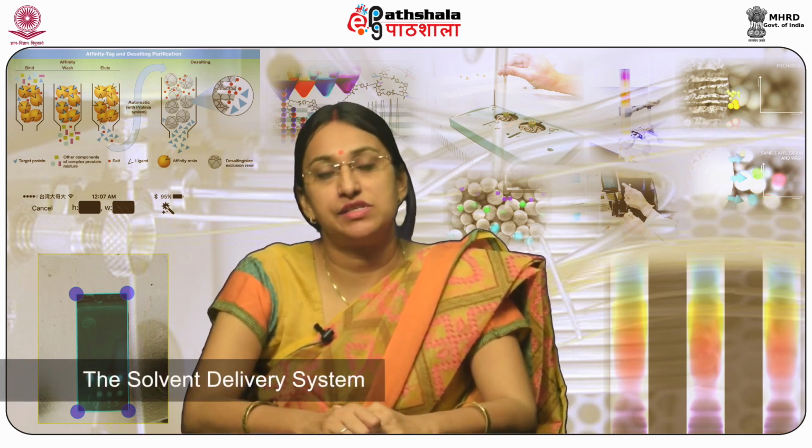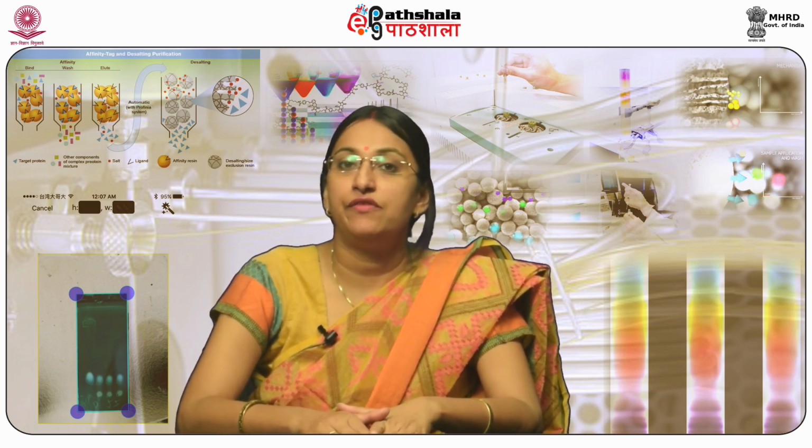Solvent delivery system. The solvent delivery system is an essential component of HPLC. It is meant to deliver the mobile phase to the column with a constant and pulse-free flow. The efficiency of the system and reproducibility of retention time is directly affected by the flow rate. Therefore, the solvent delivery system should function with high precision and accuracy.